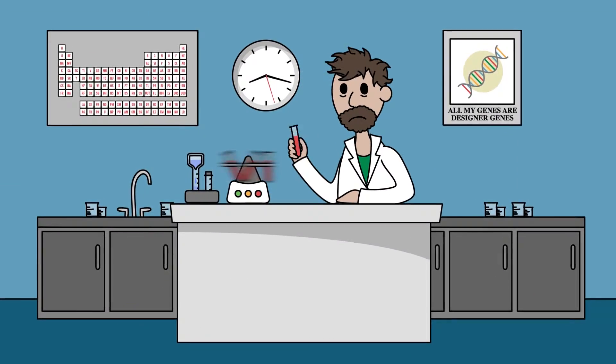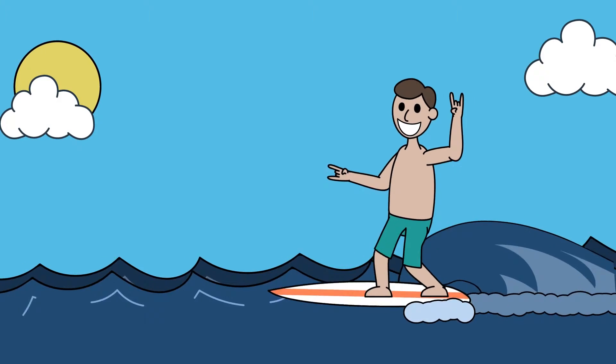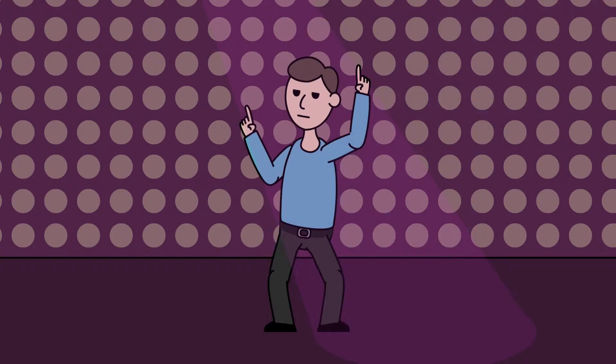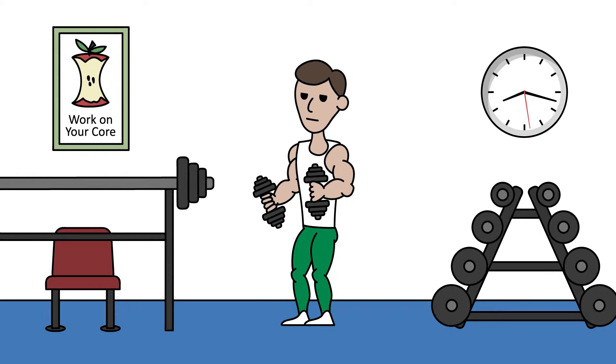So, what would you do if you could isolate plasma DNA six times faster? This, this, this? You know, that might take a little more time, but check this out.